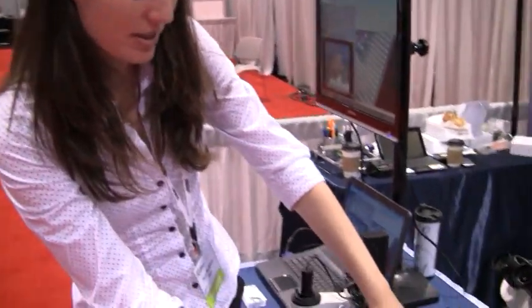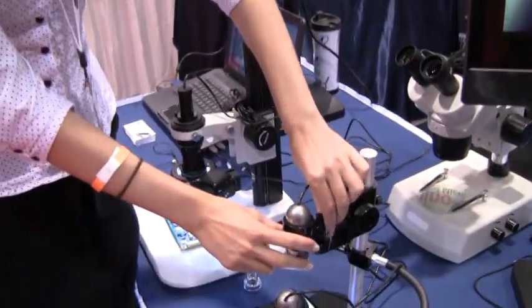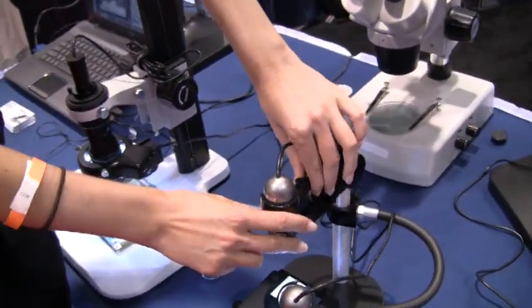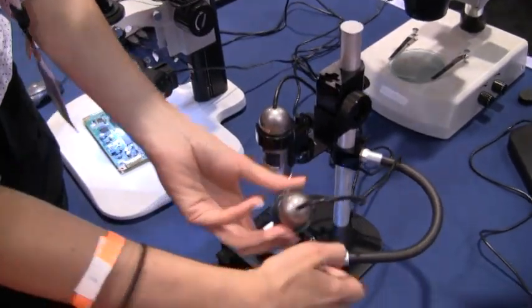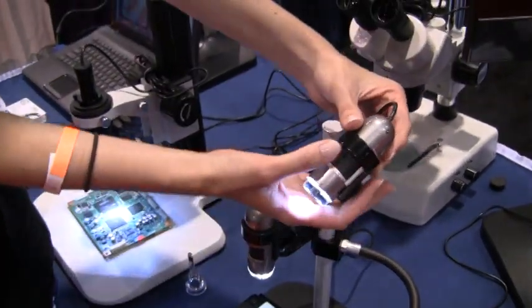These are some of our DinoLite cameras. They have built-in lights, they're CMOS sensors, and they'll magnify between about 10x and 220x optically.